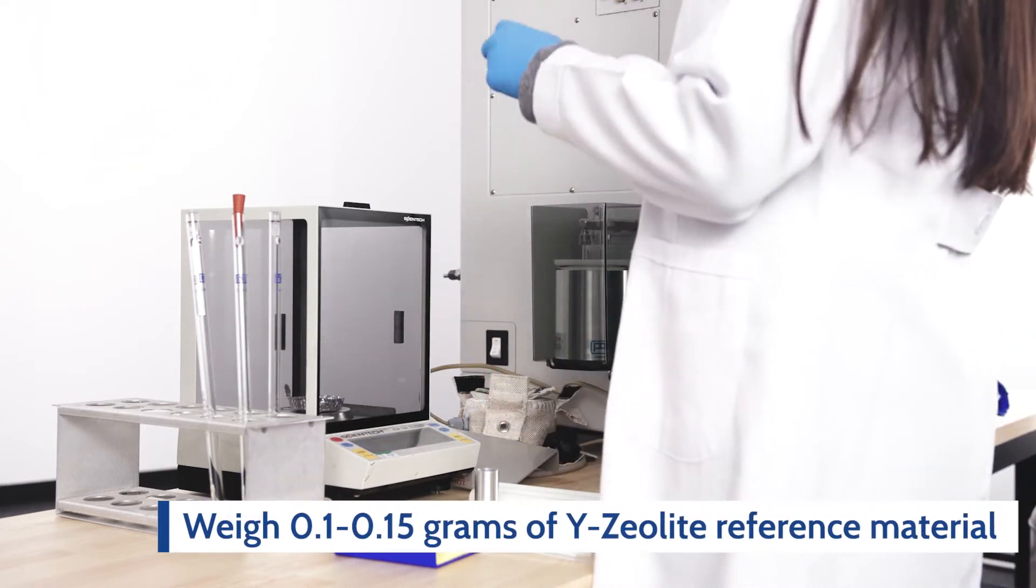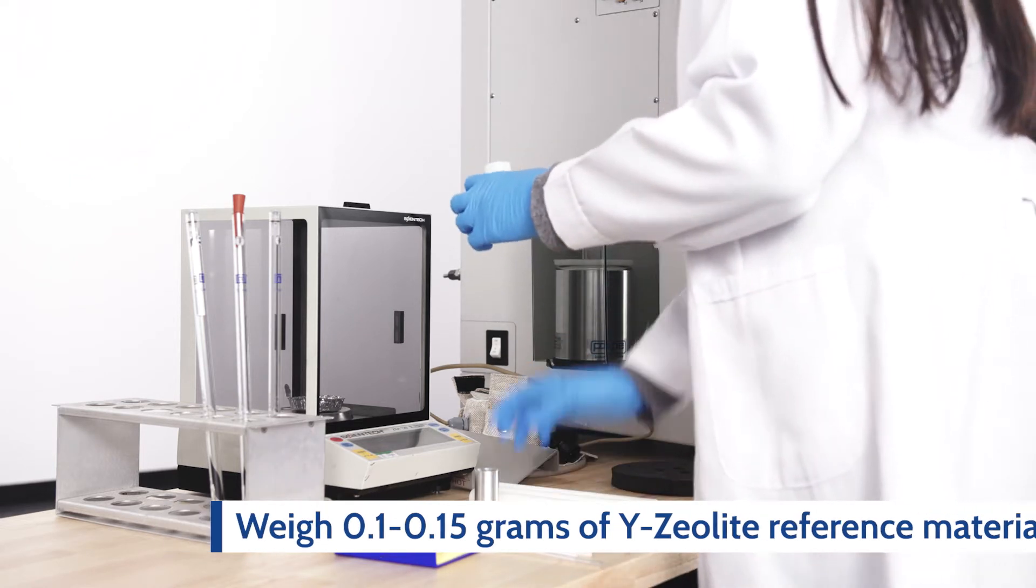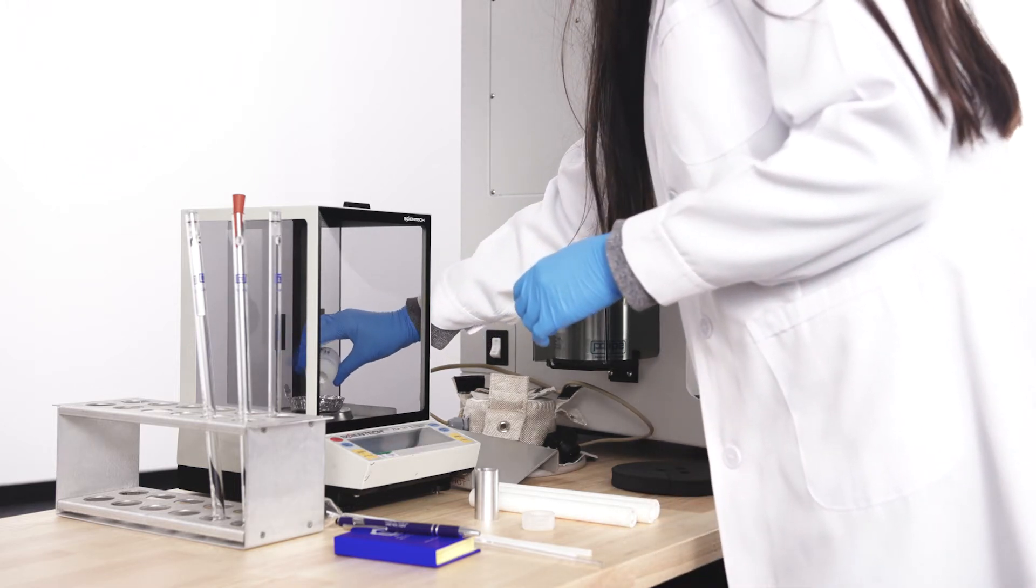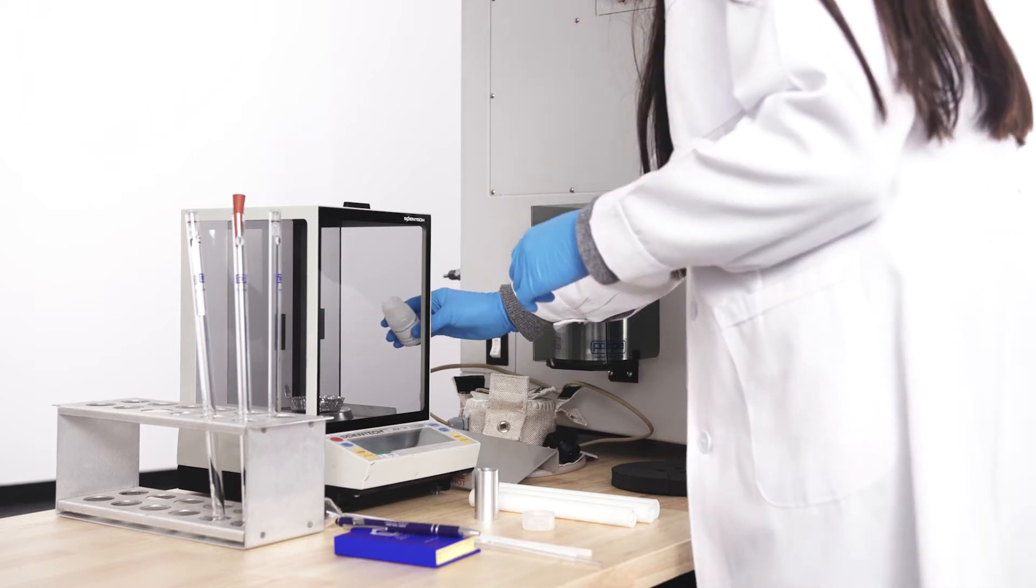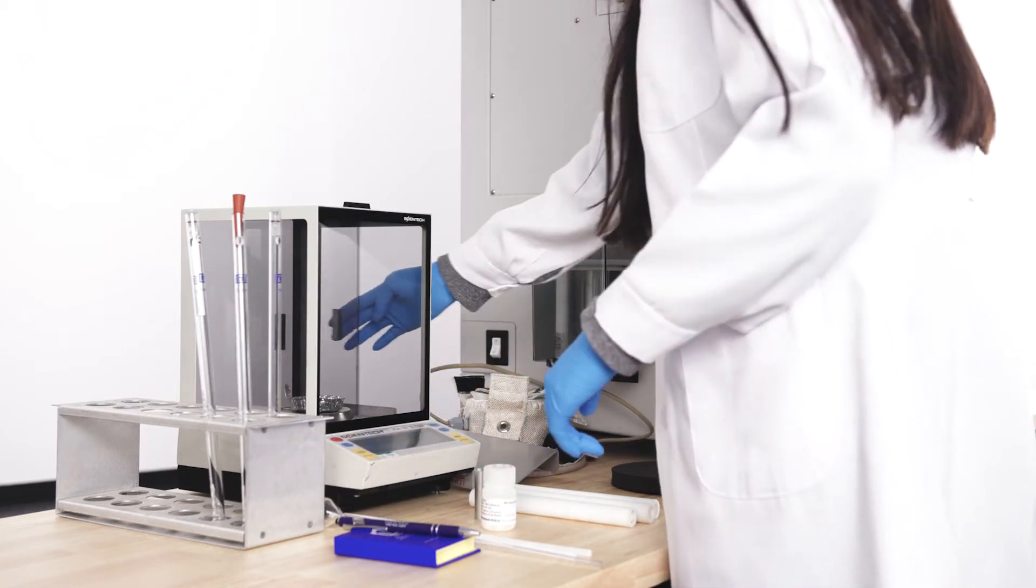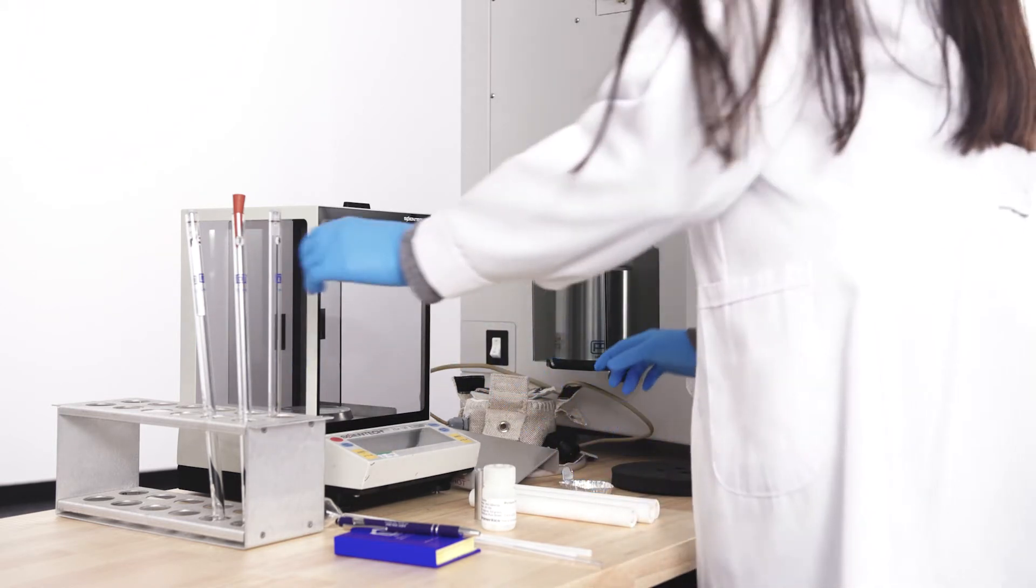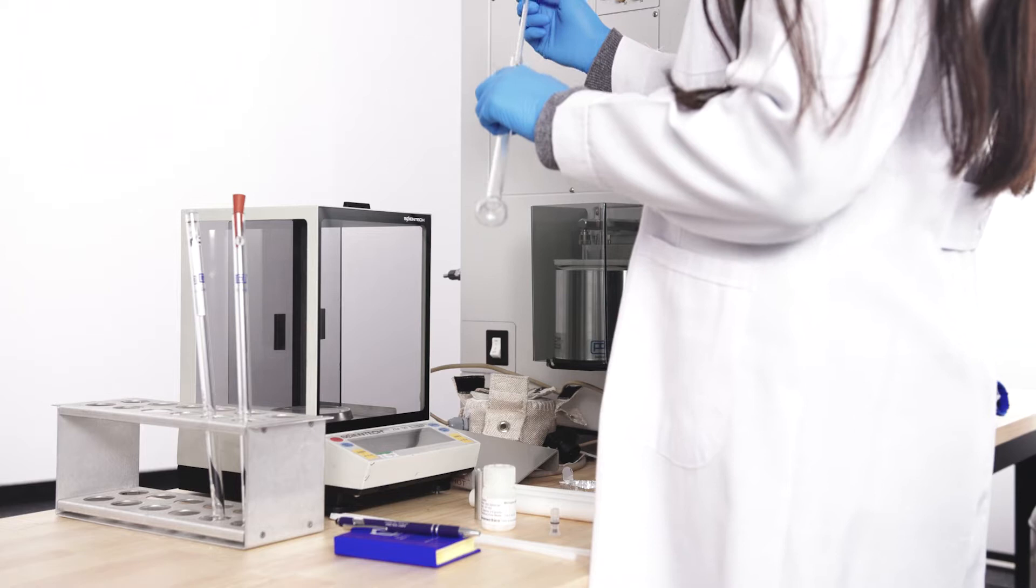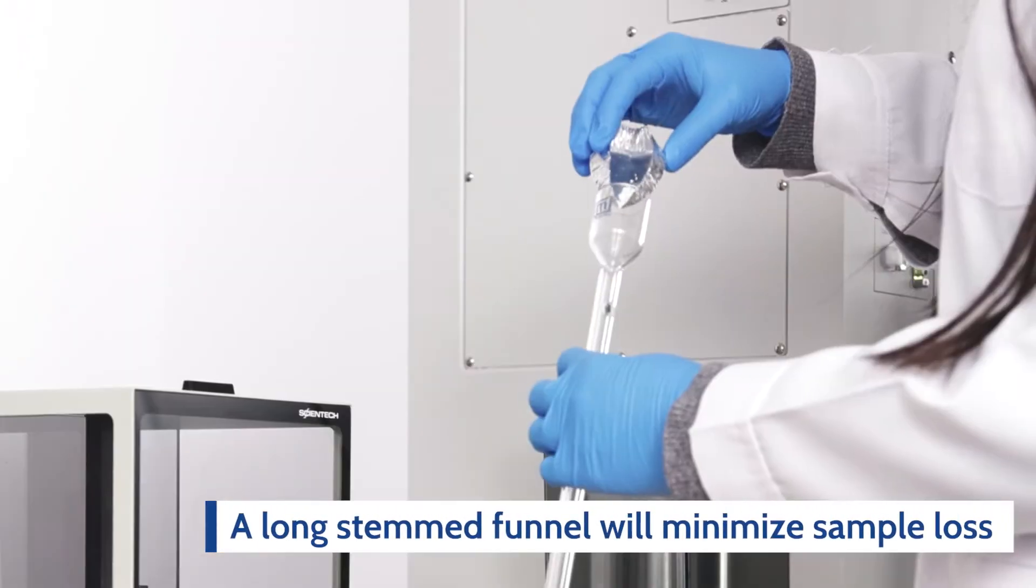Weigh about 0.1 grams to 0.15 grams of Y-Zeolite reference material and transfer the sample to the tube using a funnel. We recommend using a long stem funnel to help minimize sample loss.